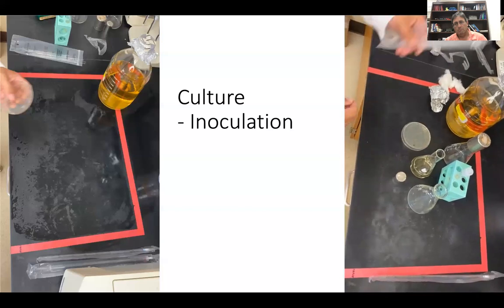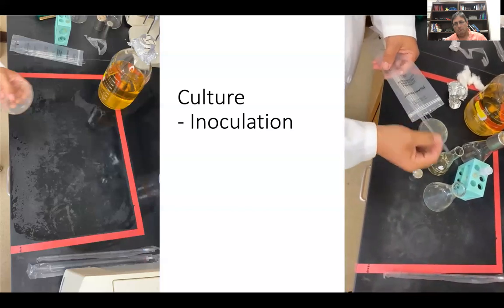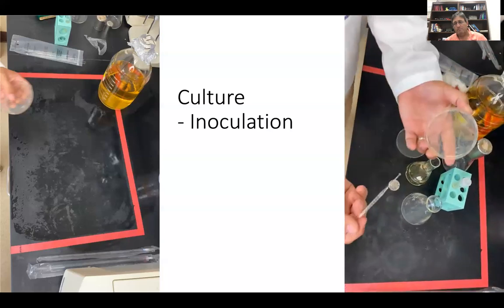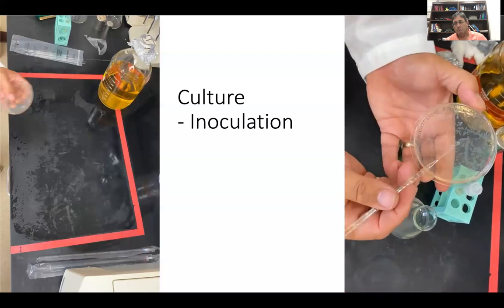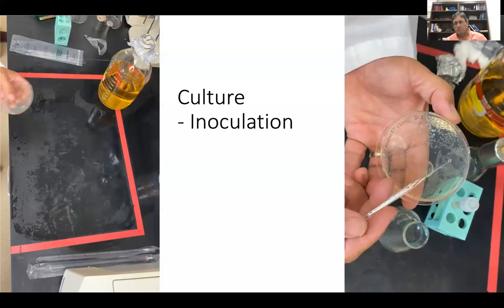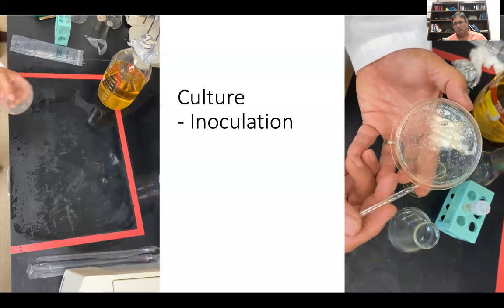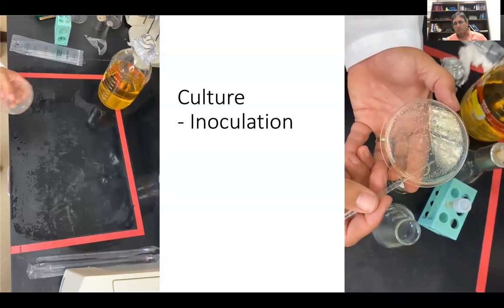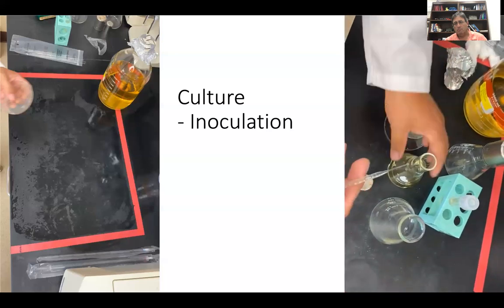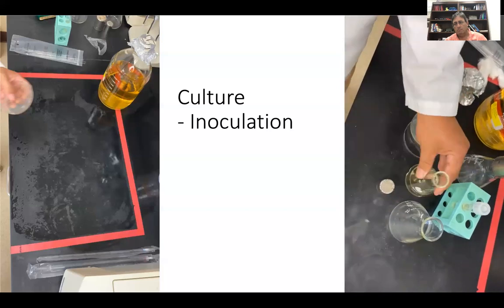So now what we want to do is isolate one of these colonies and inoculate our media. We're going to take a single isolated colony. Here we have colonies all next to each other. They're all producing an enzyme that will help degrade the kanamycin. We want a single isolated colony. We'll just scrape the surface, and then in the solution, rinse it off.